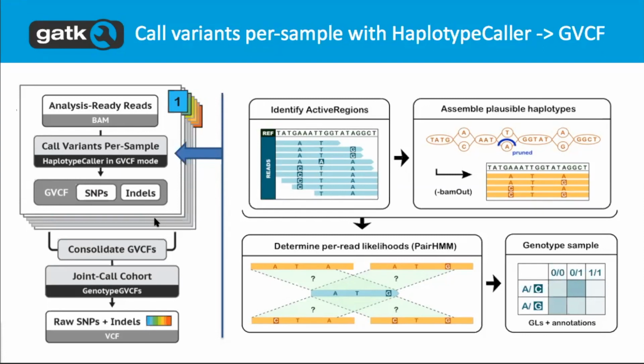That's the basic idea. Now, the problem is that data is messy, and in a lot of cases, we don't have something as clear-cut as this, especially when we throw in indels, which are insertions and deletions of short amounts of sequence. It can get pretty messy, and we need more sophisticated algorithms to deal with that.